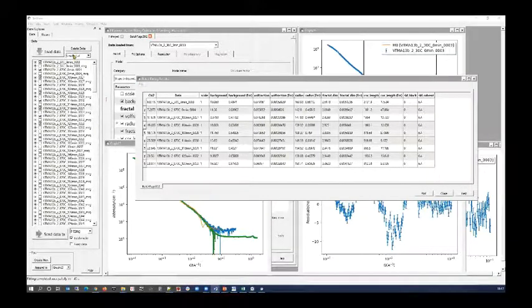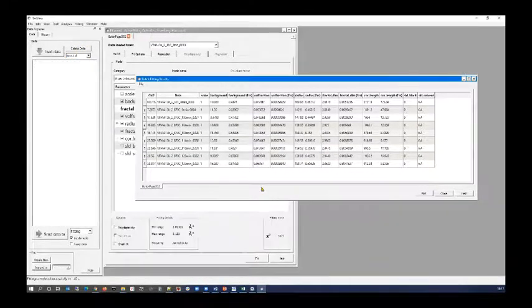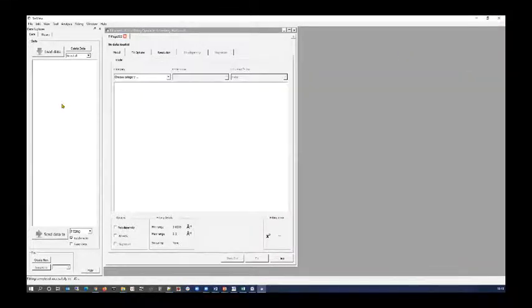Thus far, let me get rid of all this data. So select all, delete data. This will take a moment. Oh, okay, that's quick. I'm just thinking about it. Drilly hourglass. There we go.